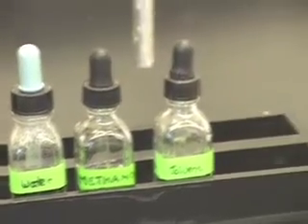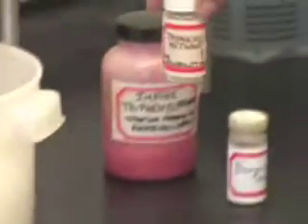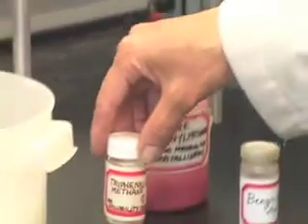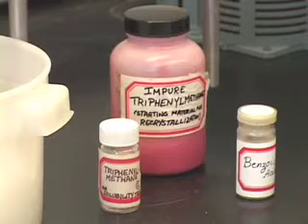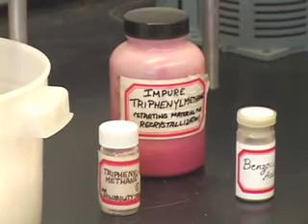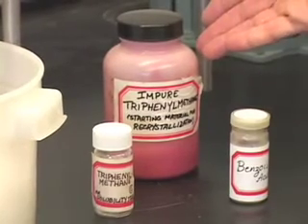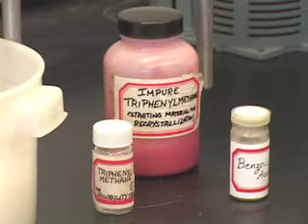When you are testing the solubility, what I would like you to do is use standard triphenylmethane and not impure triphenylmethane. The reason being, since this is the first time you are doing recrystallization, the insoluble impurities that are present in the impure compound may throw you off while selecting the solvent.